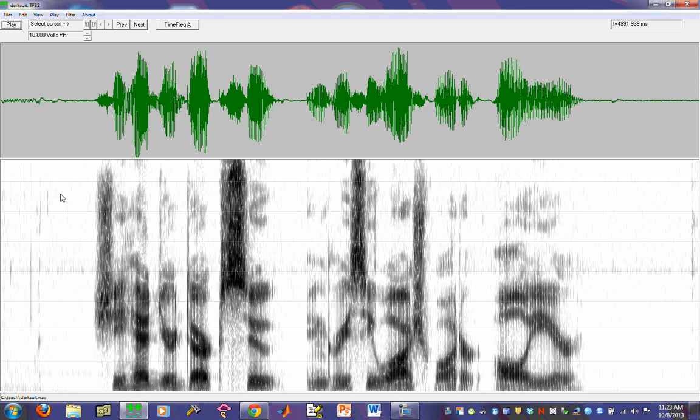So, we have a signal loaded here, and as I said in the past, the default setting when you load a signal up is to have a sound pressure waveform display at the top and a wideband spectrogram at the bottom.